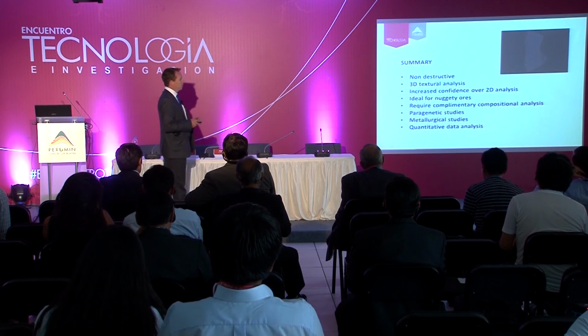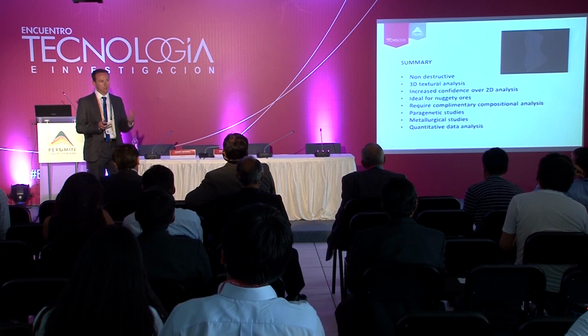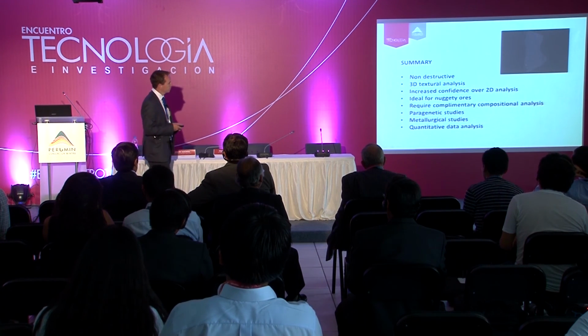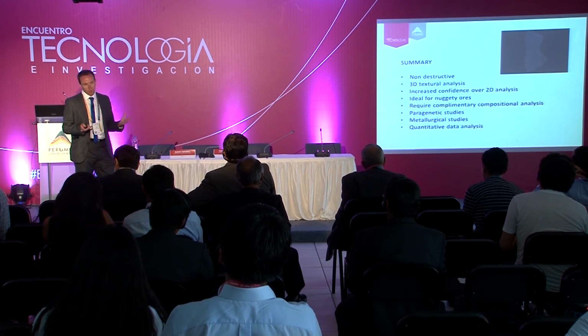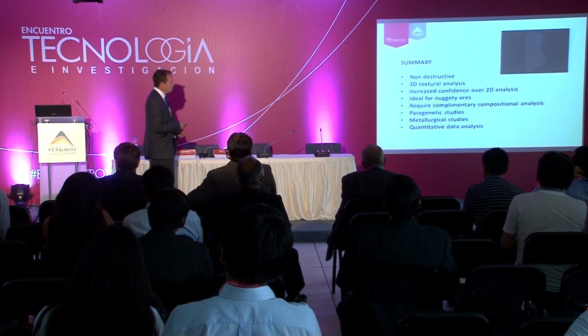It does require complementary compositional analysis because you have to ground truth your differences in density with an SEM or a microprobe technique. But it can be applied to paragenetic studies.